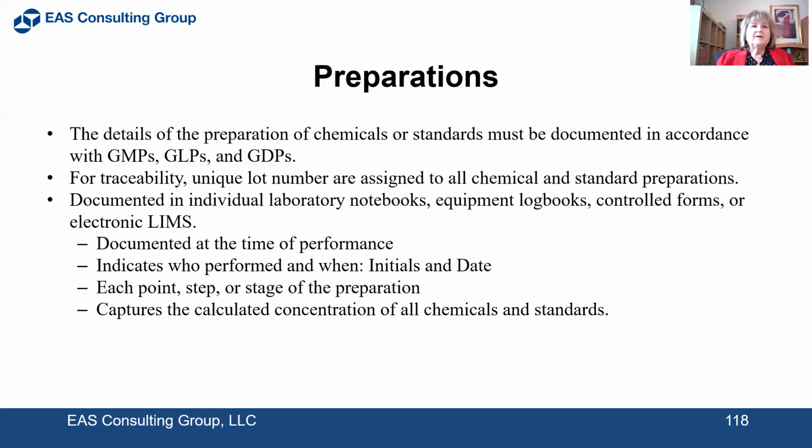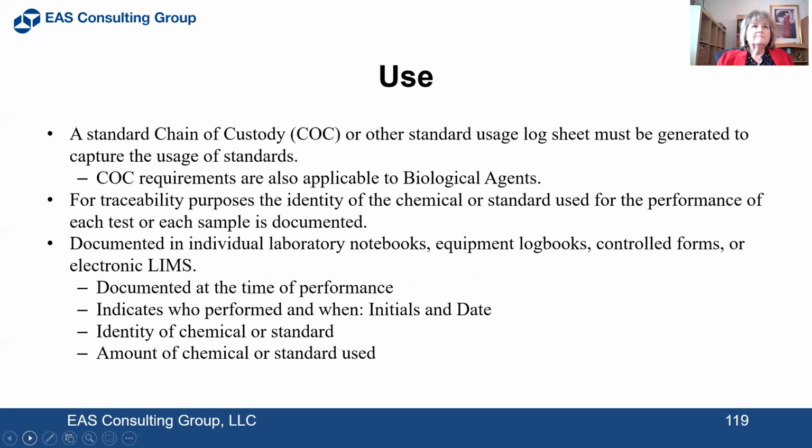Each point, step, or stage of the preparation must be documented, and it must capture the calculated concentration of all chemicals and standards. So a standard chain of custody or other standard use log must be generated to capture the use of standards. Chain of custody requirements are also applicable to biological agents.